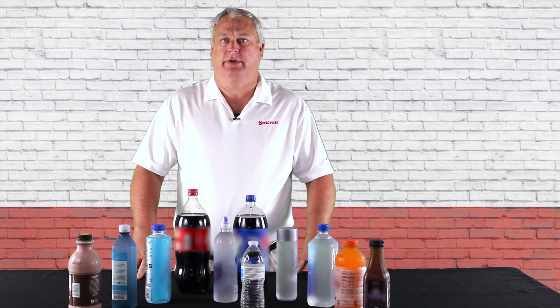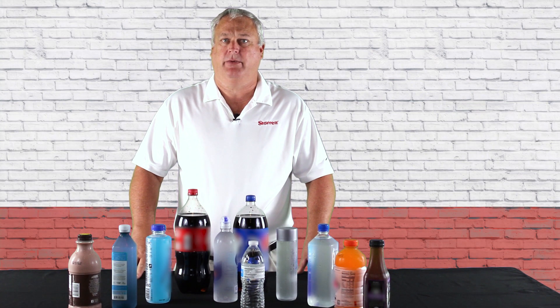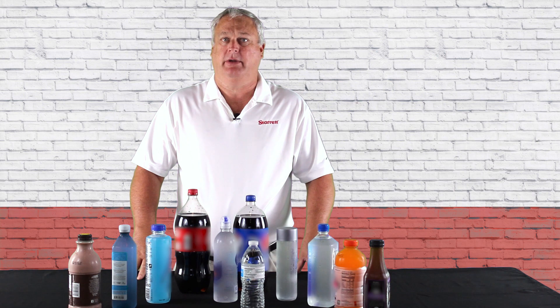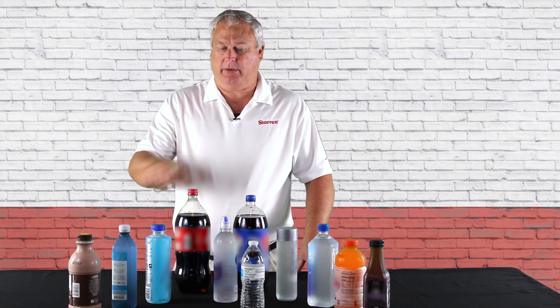Hello and welcome to another edition of Starrett Video Support Series. I'm Eric Perkins and today we're going to be talking about top load testing on bottles.